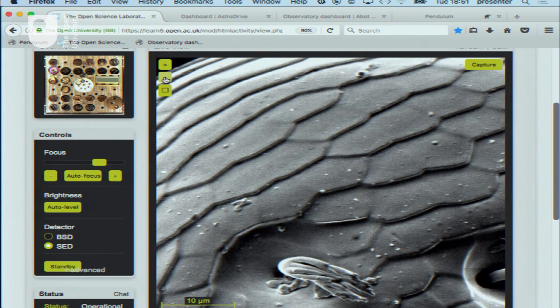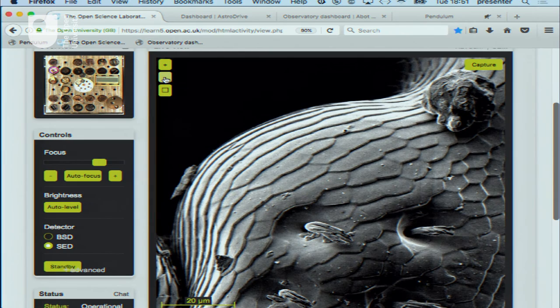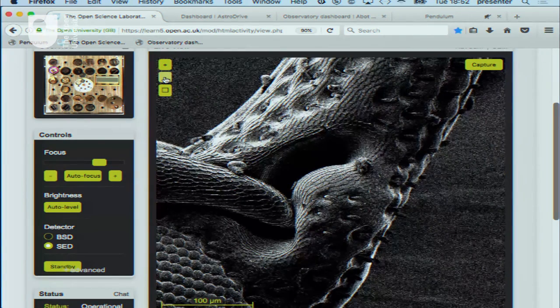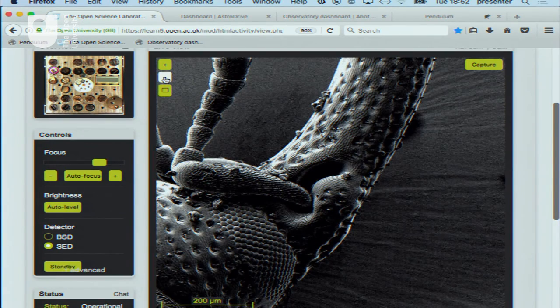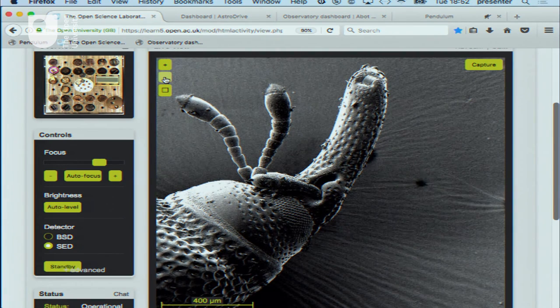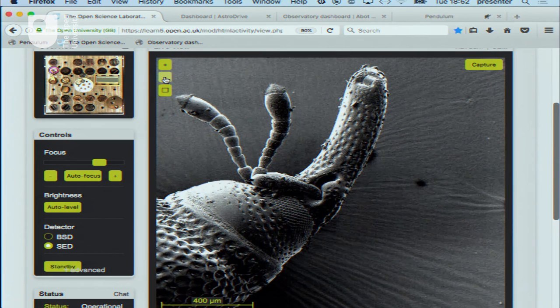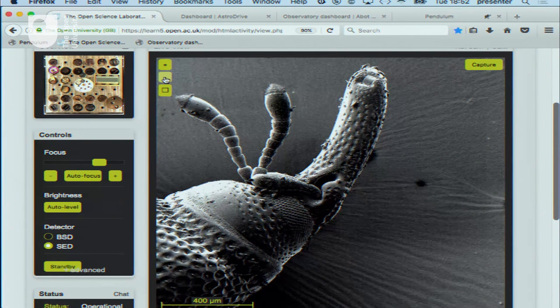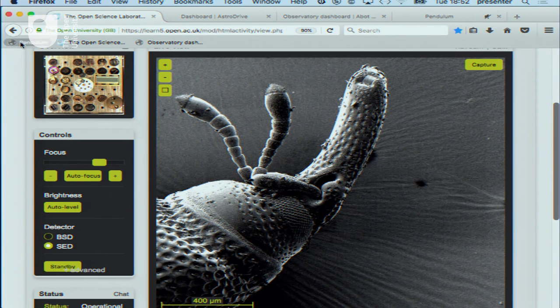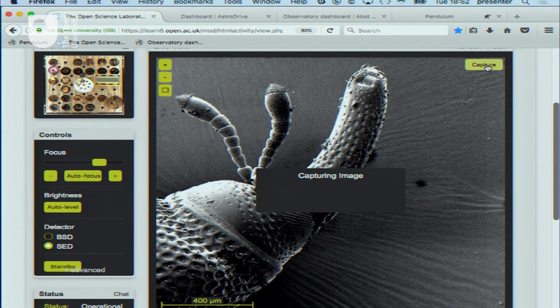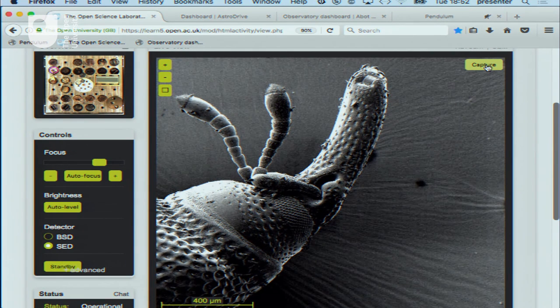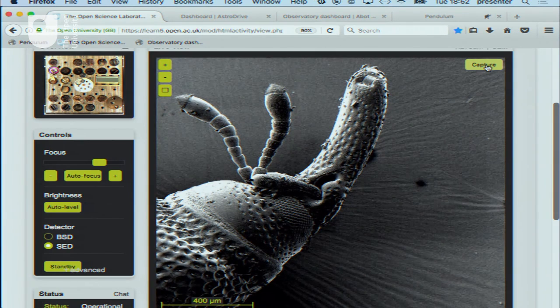The live image, initially appearing as a horrendous material, is revealed as the front end of a rice weevil - something guaranteed to excite a crowd. The interface allows changing focus, collecting levels, and capturing images that are stored on the user's computer and can be used in student reports. Even a simple opportunity to see something exciting up close, like a creepy crawly, is a fantastic opportunity for student engagement.